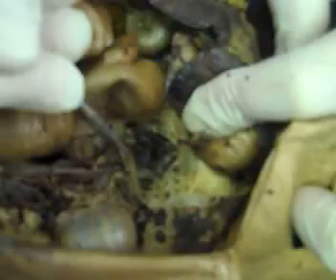The adrenal gland is anterior and medial to the kidney. In your case, that's a little bit of the adrenal gland right there. Yours did not separate out very nicely, but this is the region where it would be. Okay? And this might be part of it right here. I'm going to have to find it on another person's. I thought it was better than it is. I'm looking in the right area. I'm not seeing a very good adrenal gland. Okay?